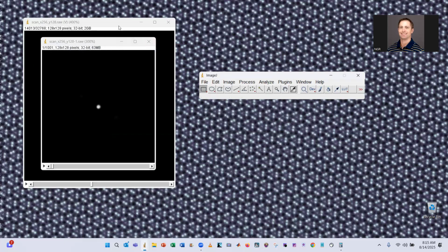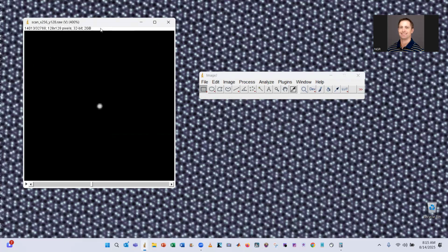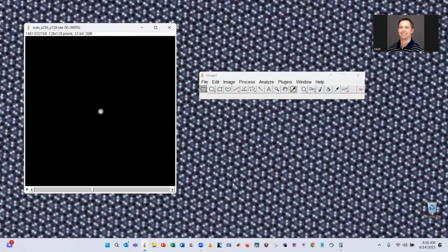Okay. All right. So that was the quick hitter video, or the somewhat quick hitter video, I wanted to do about basic visualization of your 4D-STEM data using ImageJ, as well as exporting of the data as individual TIFFs for later processing. Again, keeping in mind that you need to actually flip the DPs vertically, right? Before you do your reconstruction in your reconstruction software.